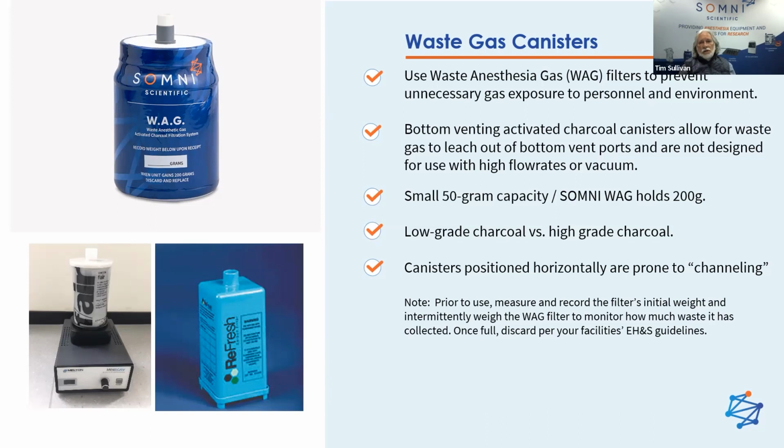This allows the activated charcoal to do its job and collect the isoflurane molecules going up through it. The quality of the activated charcoal in these different filters also makes a big difference on the efficiency of the canister. As you'll notice, the size is also important.